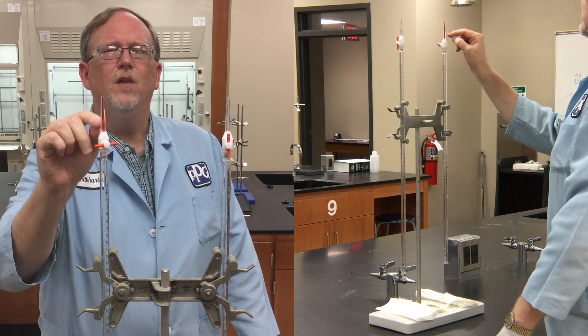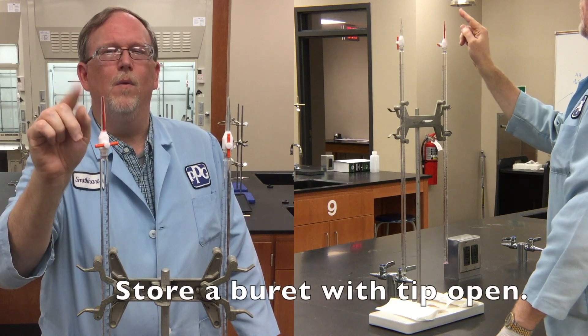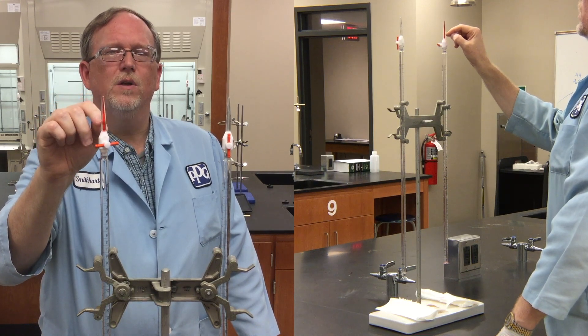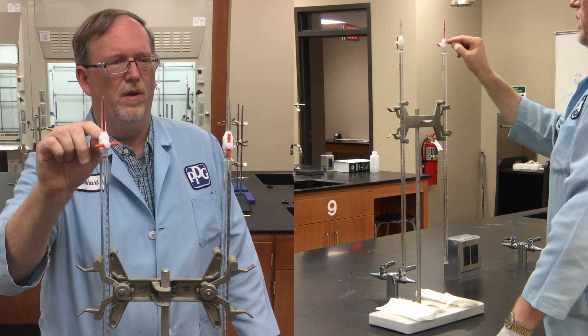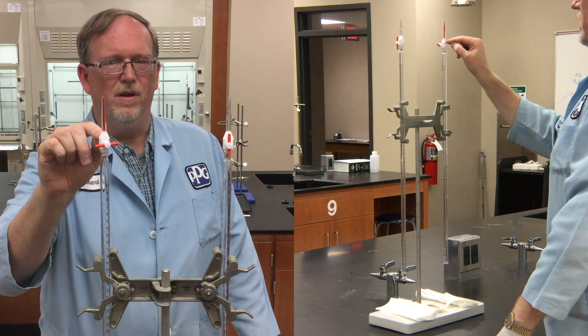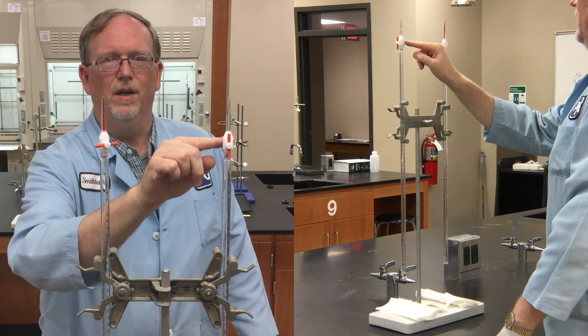The solvent inside this tip will evaporate over time, and the crystals of whatever solution we made up will clog up the tip, rendering this inoperative. So we do not want to leave it in this condition. Leave it instead in this condition.